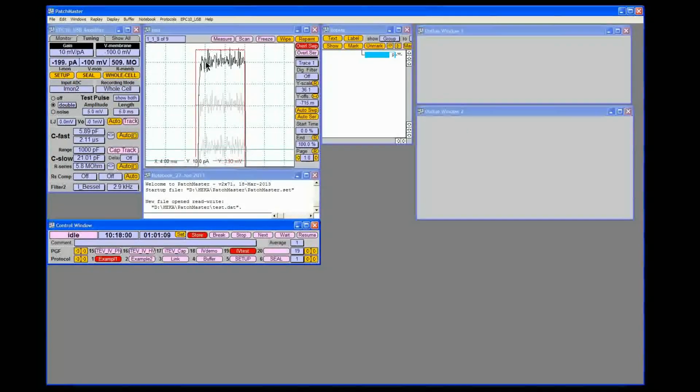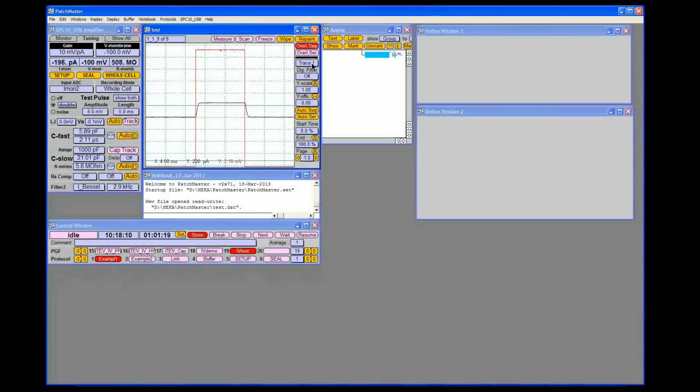Unfortunately, I had specified some very large scaling factors before I started, and so part of it started off the screen. So we could easily just reset for trace 1 and then for trace 2. And now we can modify our display the way we would like.